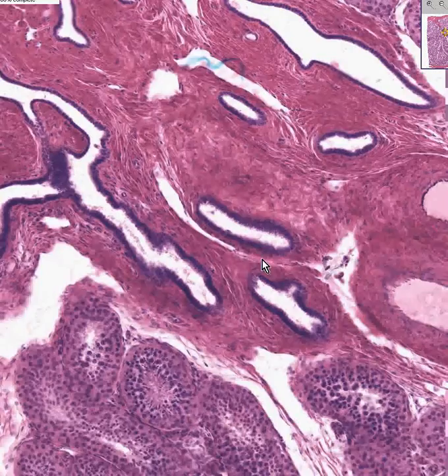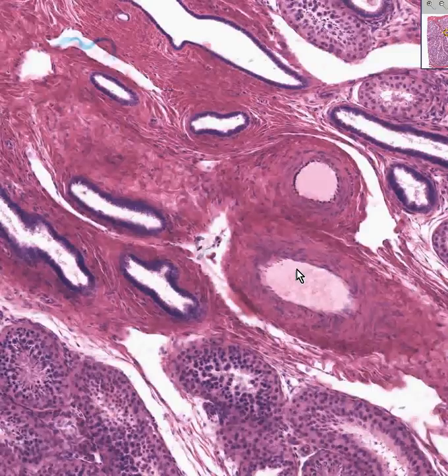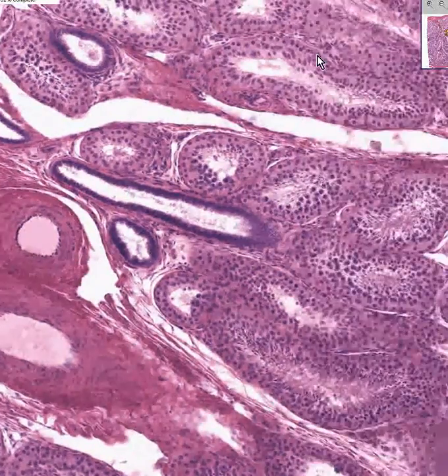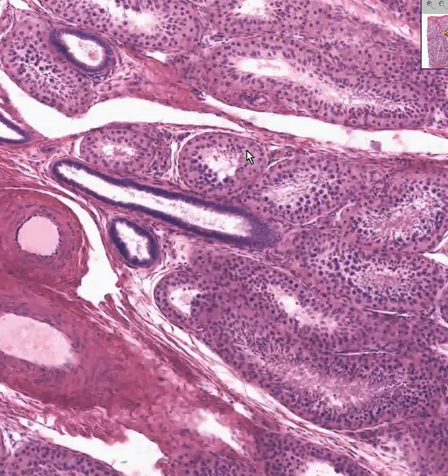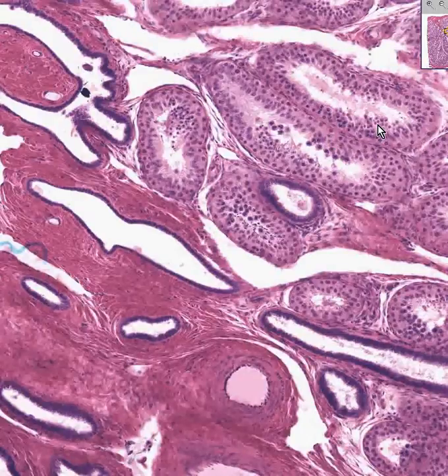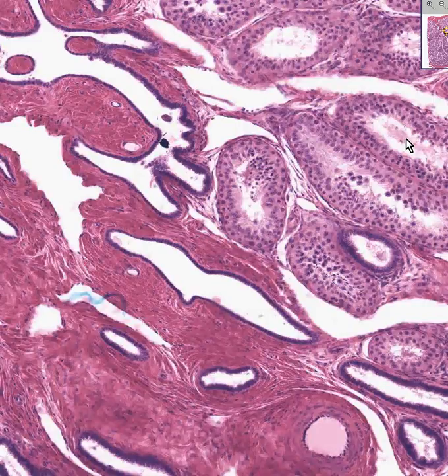Now, I want to tell you something that we may or may not see here. You know this is an artery. You know these are ducts lined by columnar epithelium. There is a series of tubules between the classical seminiferous tubules out here and the rete testis, which are called the straight tubules. And I don't think we're going to find any in this one, and it probably doesn't matter. But just remember, if you see tubules in the testis that are not part of the mediastinum of the testis or rete testis like you have here, and they're not seminiferous tubules, but they're lined entirely by Sertoli cells, then you know that those are the straight tubules or the ductuli recti.